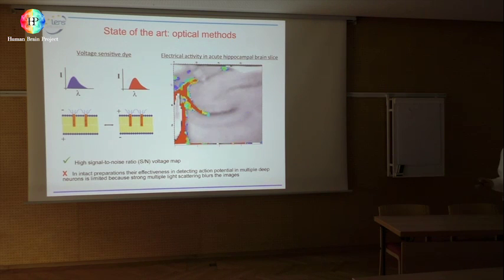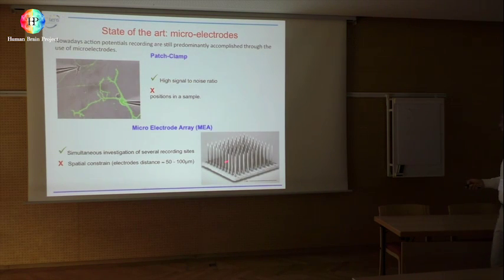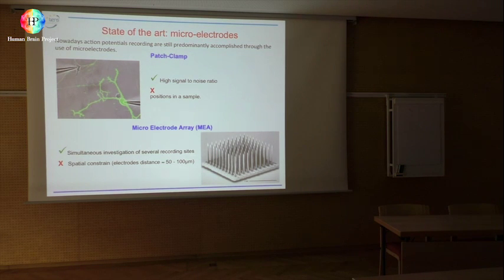of calcium signal. And when you have, for example, the multi-electrode array here, you can place cultivated neurons on it, and then every one of these electrodes records electrical activity, but not of a single neuron.